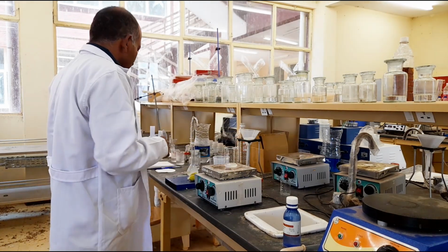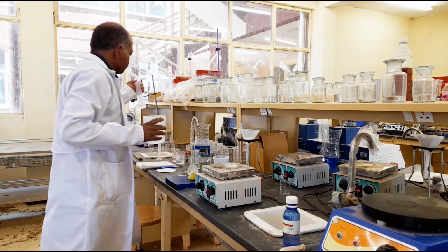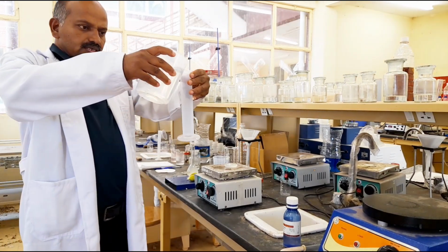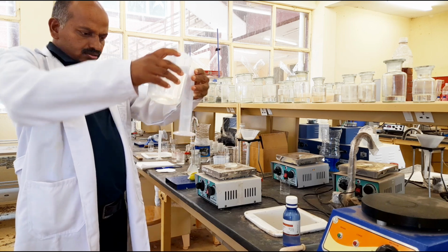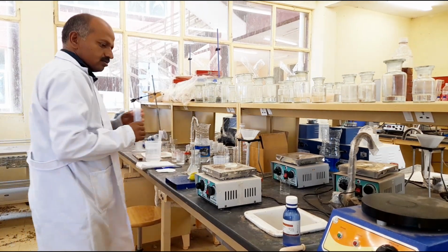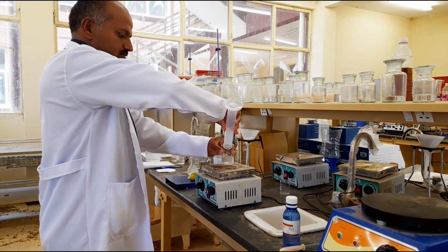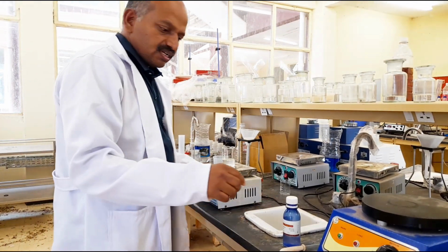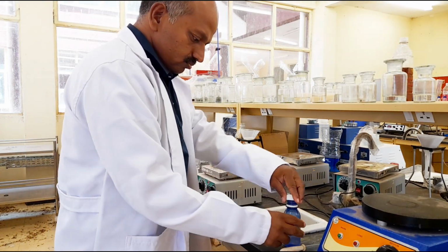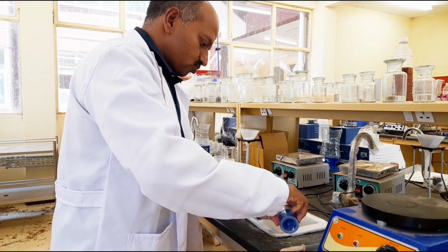Now I have to add 30 ml of distilled water. Using a measuring cylinder, I am taking 30 ml of distilled water, approximately, into this. Now, as per the procedure, I need to add the phenolphthalein indicator. So 2 drops of phenolphthalein indicator are to be added.